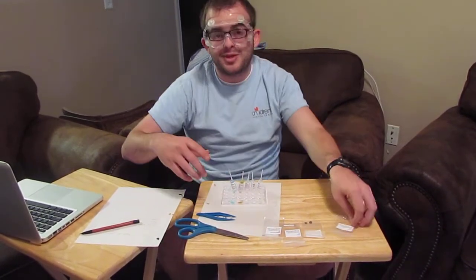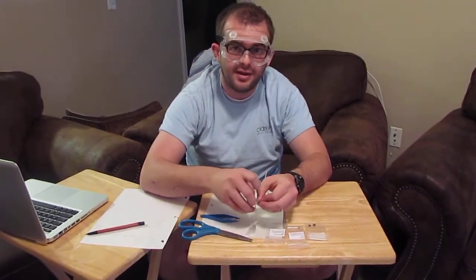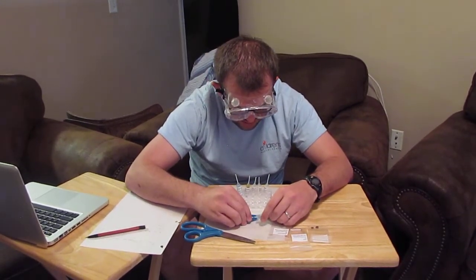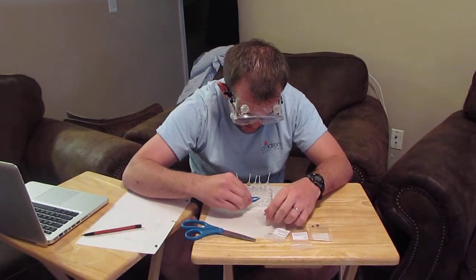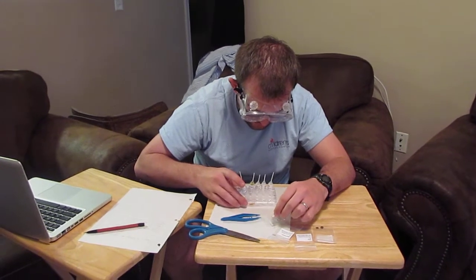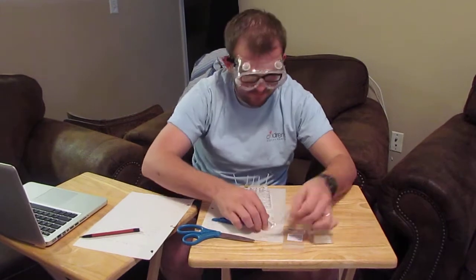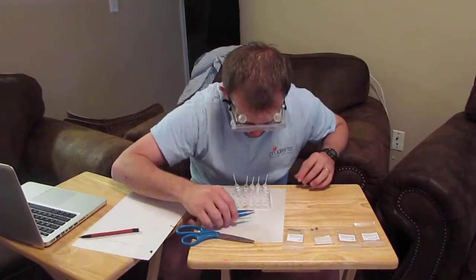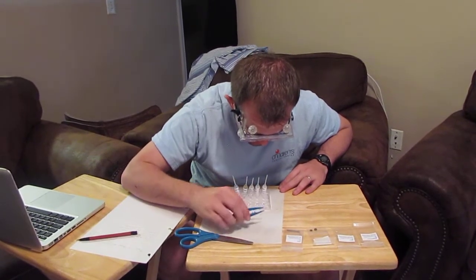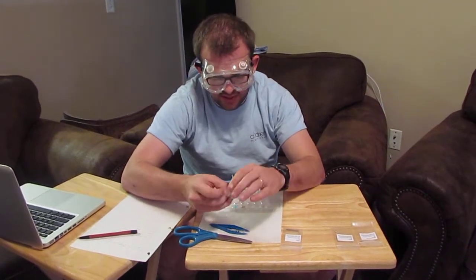I don't see any immediate reactions, so we're going to move on, and I want to keep observing that. Here we have zinc, and in like manner, just try and get it, and we're going to put it in the magnesium sulfate. So again, I don't see anything happening immediately, and our magnesium strip still hasn't changed. So I'm going to move on to lead.